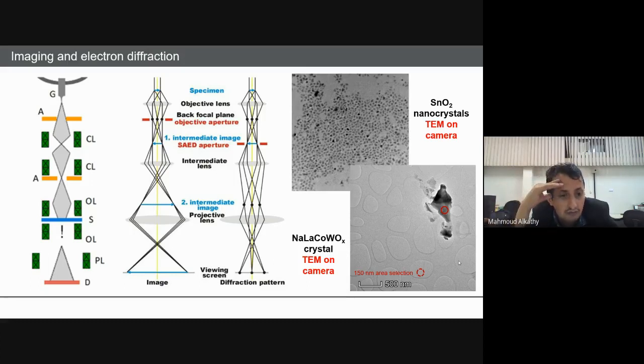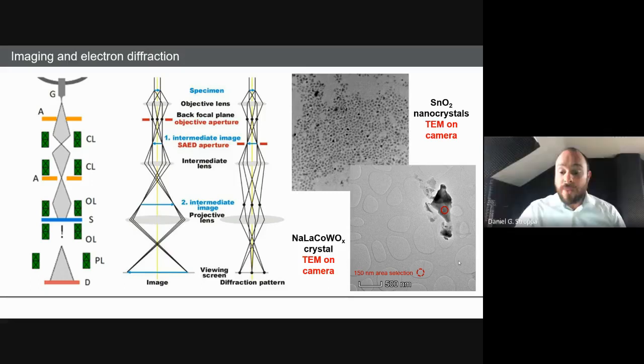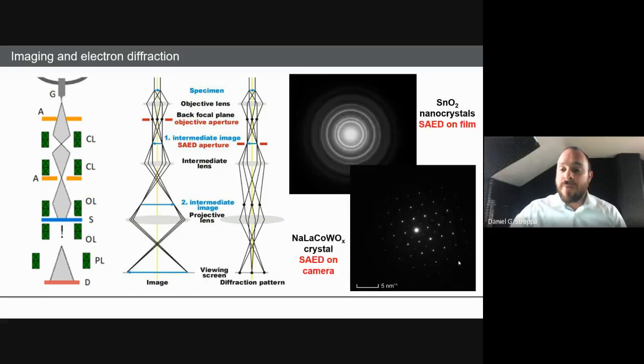And you have this on a single slab of material scattering. Now imagine that you have multiple of those monocrystals just rotated with respect to each other and in different orientations. Then if you have enough of those crystals, you're going to have this ring-like pattern.